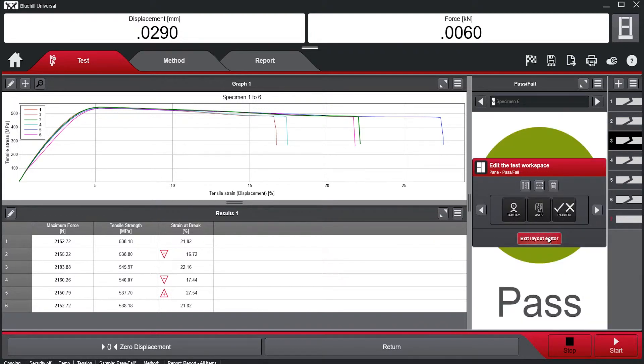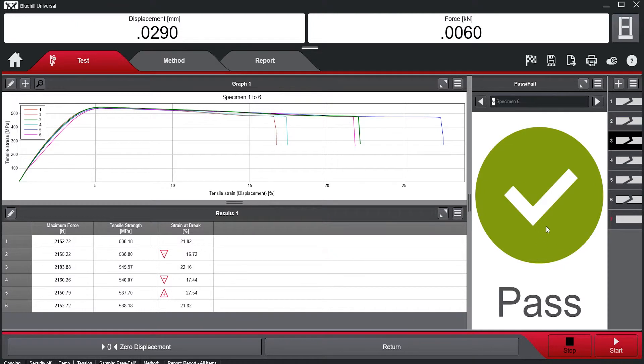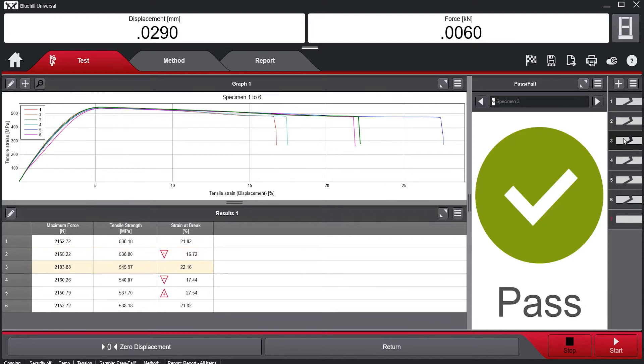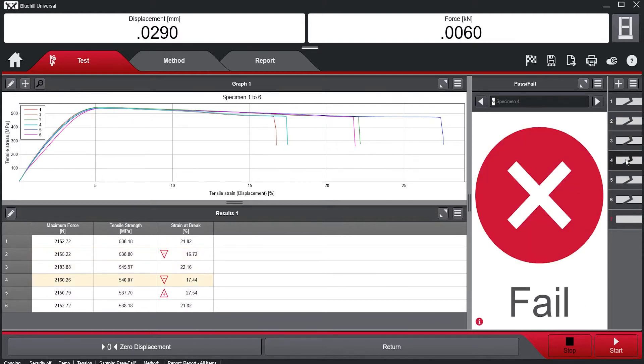Once the Pass-Fail module is enabled, it provides a clear, unmistakable visual indicator of the test status. This allows for quick recognition of out-of-specification materials and products.